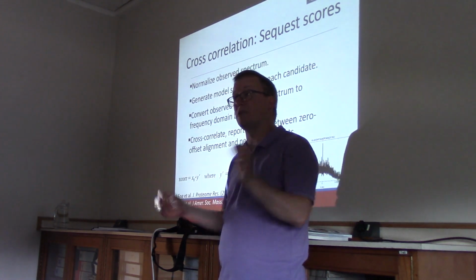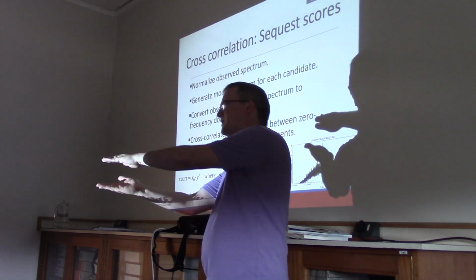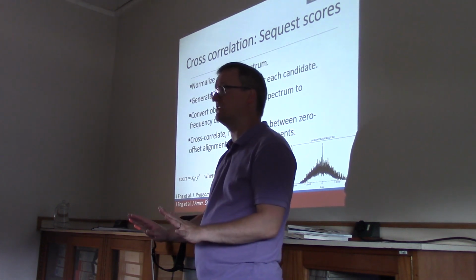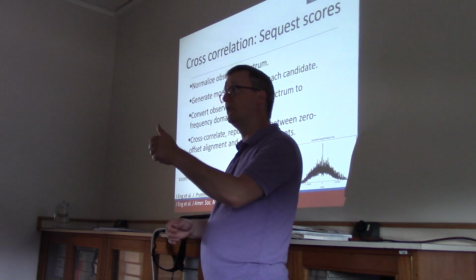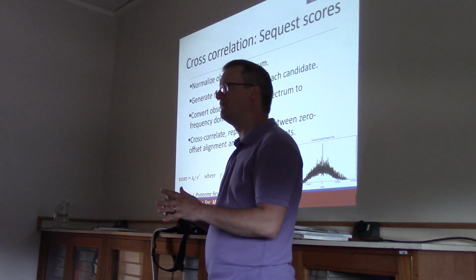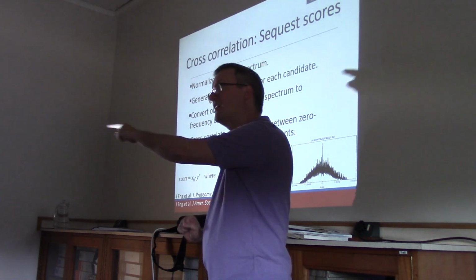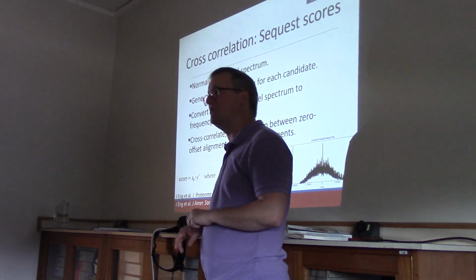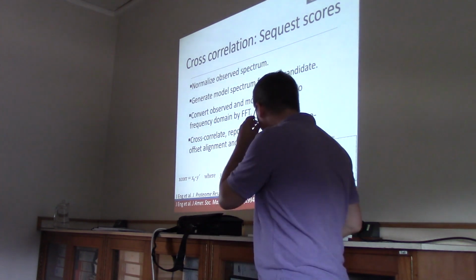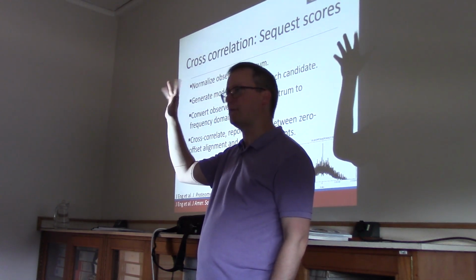You might have software that tries to say these ions, being Y ions, should be taller than these ions, which are B ions. Some might even try to take sequence-specific effects into account. For example, proline breaks much more readily on its N-terminal side than its C-terminal side. But frankly, most software doesn't go that far. It mostly says, these ions should be Ys, these ions should be Bs, and it may model different heights for the two.